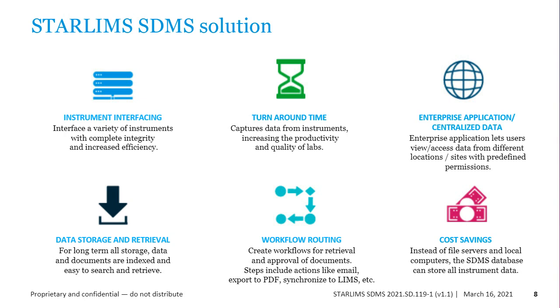The data can be stored across locations, and we have role-based access to the data that is stored in the SDMS database. The role can be site-specific with predefined permissions, very similar to your LIMS or ELN systems and how they work with role-based access to the data. It also serves as a single data storage and retrieval system.